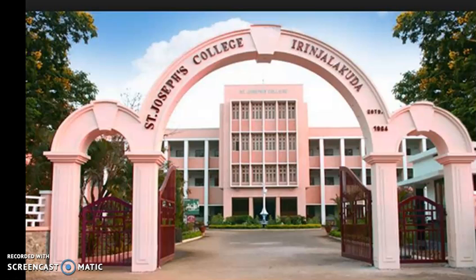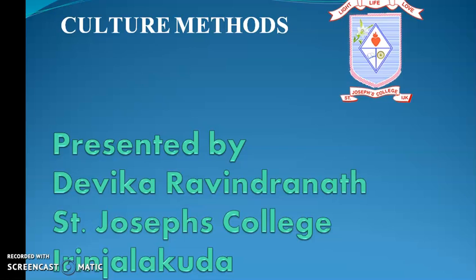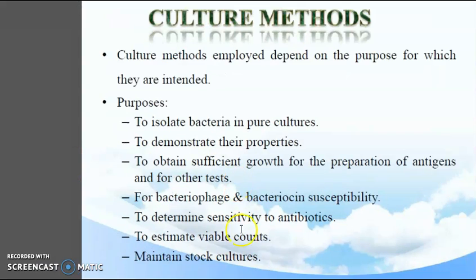Hi dear students. So today let's discuss culture methods. The culture methods employed depend on the purpose for which they are intended.